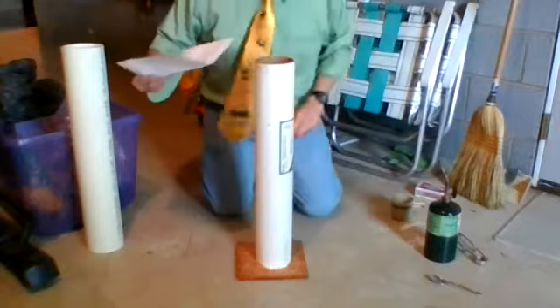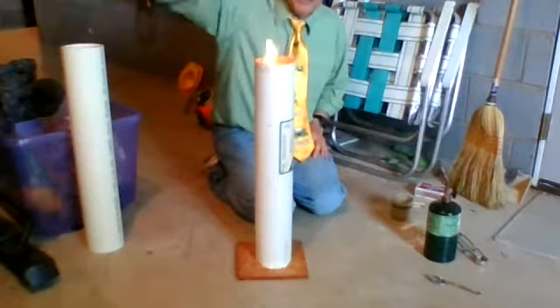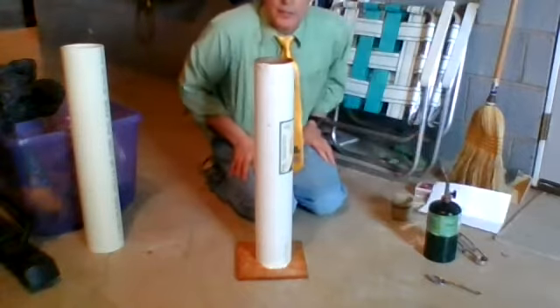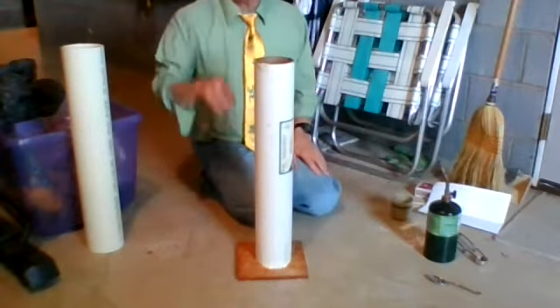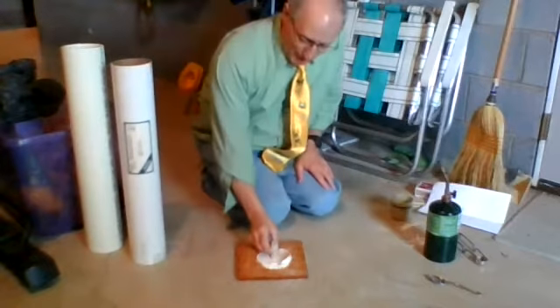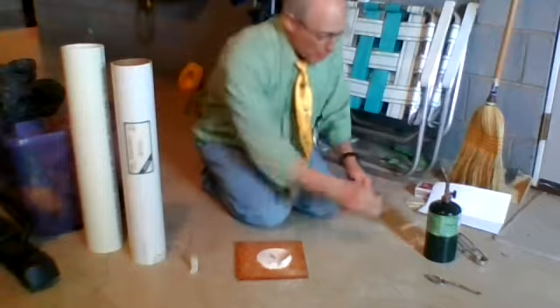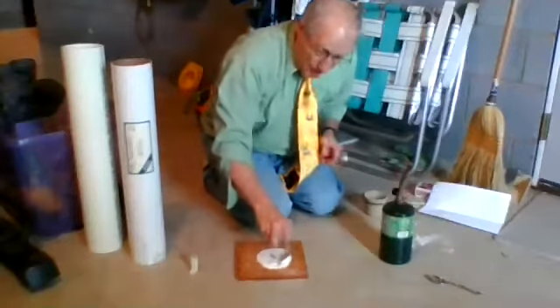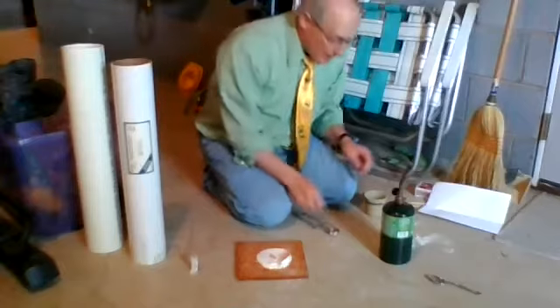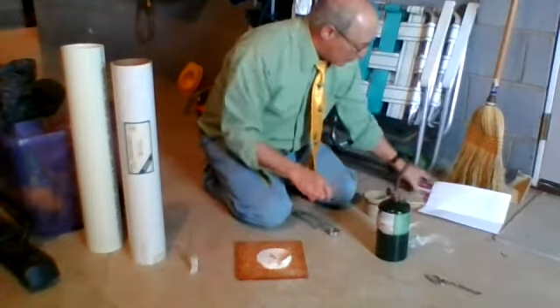Oh yeah, did you see that? Okay, normally I use lycopodium powder, and so it gets a bigger old poof. Now, you saw the flame come out of the top of the tube. And so this right here will show you that if it's clumped up, there's not enough surface area. When I was sprinkling it in, there's a lot of surface area letting the oxygen get to all of the fuel.